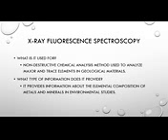X-ray fluorescence spectroscopy is used in analyzing soil surveys, mining, cement production, environmental studies, glass production, and field analysis, just to name a few.